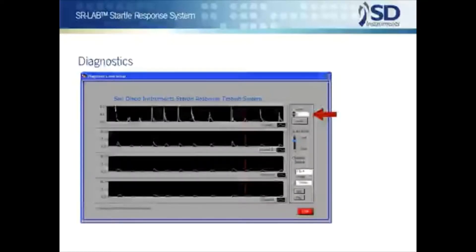You can also test and adjust the audio startle pulse from the same screen. Enter a value in the box labeled audio and produce a sound level that correlates directly to values in the trial and session definitions. Then dB levels can be confirmed with the sound pressure level meter that's included with each system.